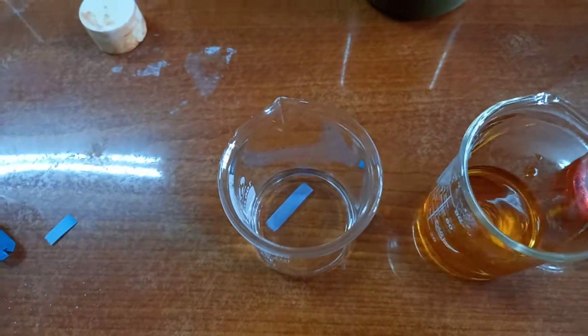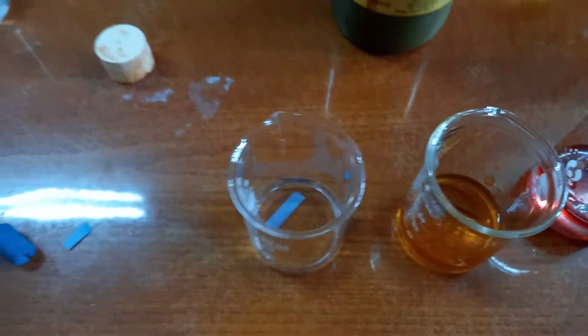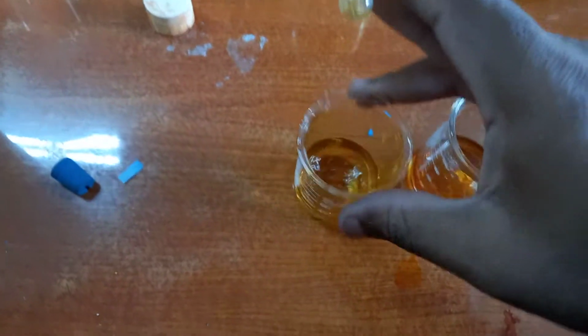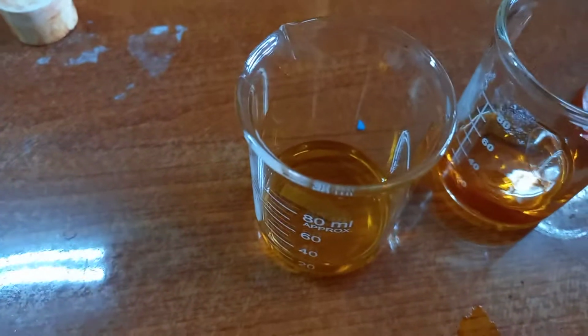It's slightly orange for the ketone. And now for the alcohol. It's yellow, a little close to orange, but it's kind of yellow or orange-ish.